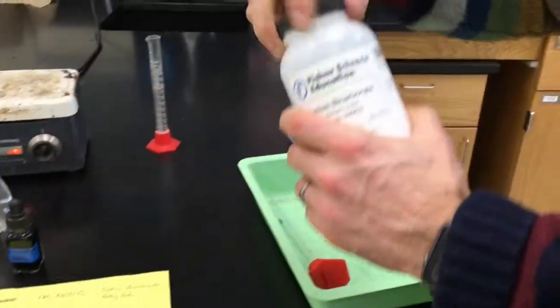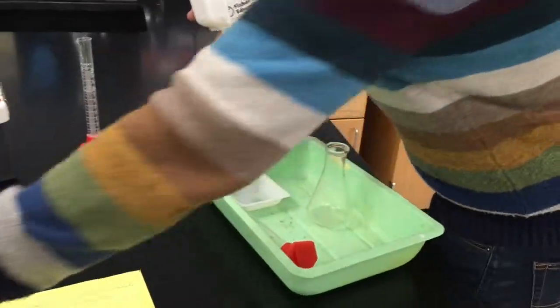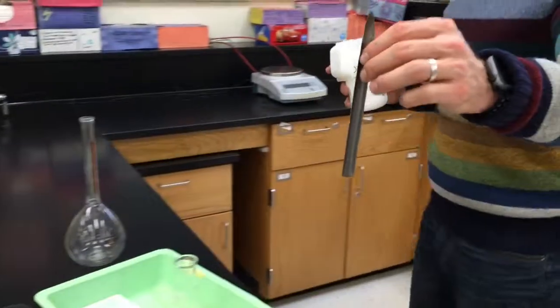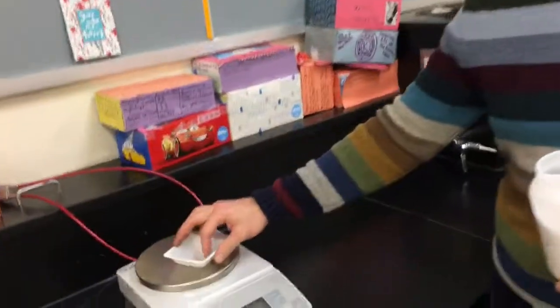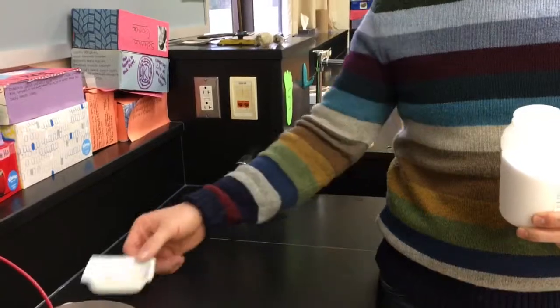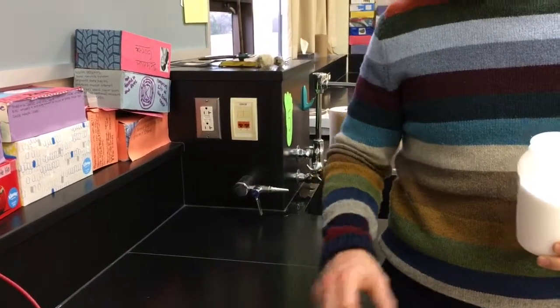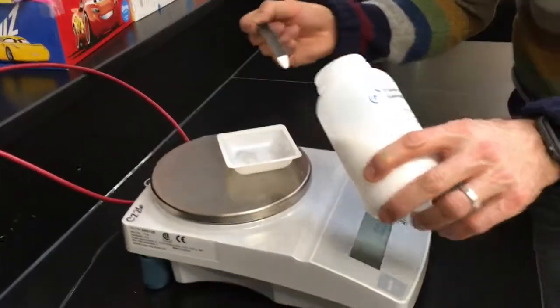So I'm going to go to the scale now, and you'd probably take a scoopula. For real, that's the best name they could come up with for this thing. Well, I heard they came up with it because it's like a hybrid between a spatula and a scoop. Really? Yeah, it's kind of like a spork, you know? It's like a spoon and a fork. Oh, is that Taco Bell came up with that? Maybe.